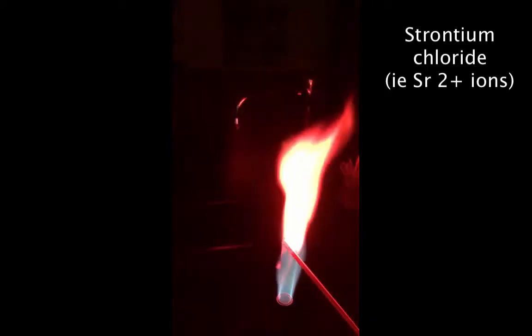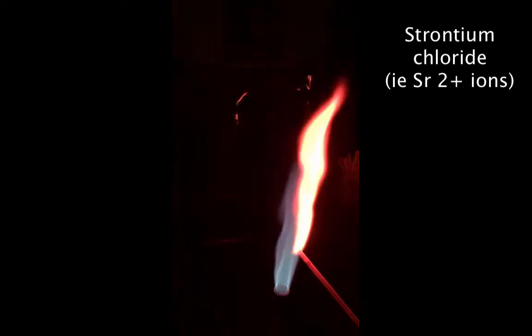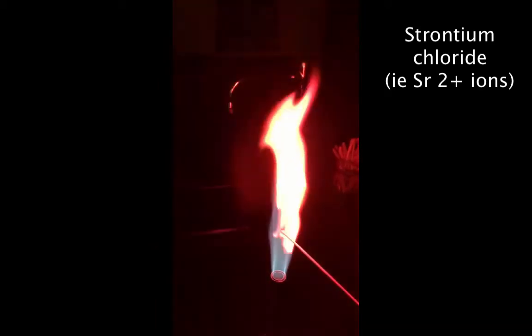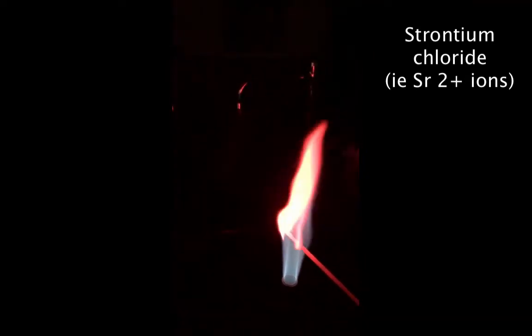The next one we're going to burn is strontium chloride. I took a wooden splint, dipped it into the strontium, and we get this reddish orange color. What this is doing is burning the strontium from the strontium chloride salt.